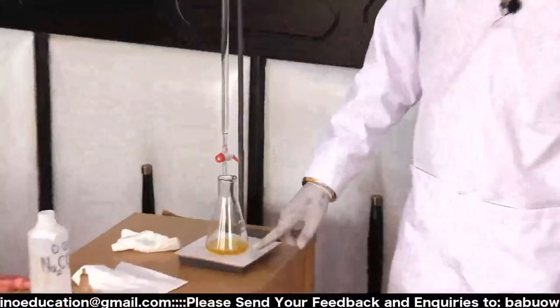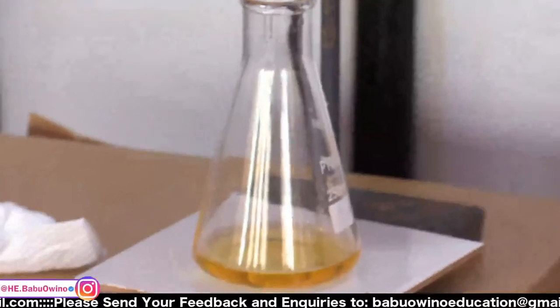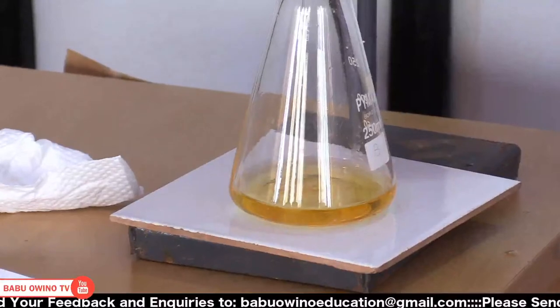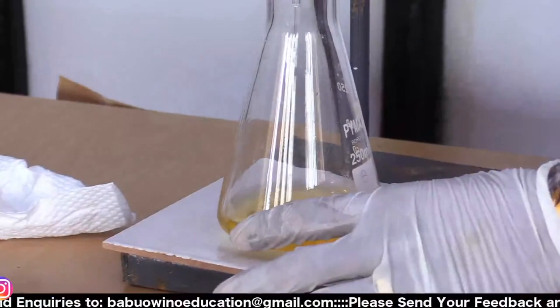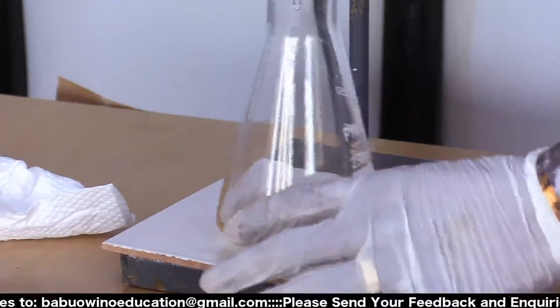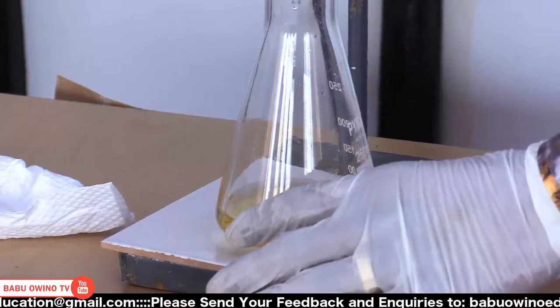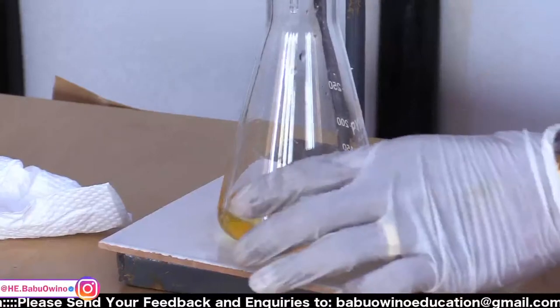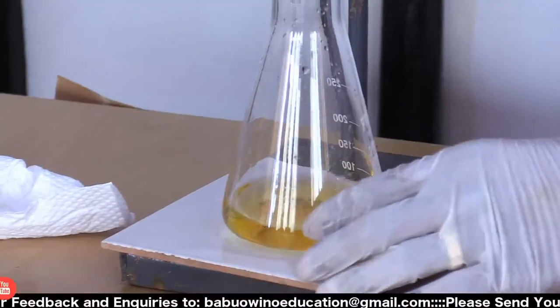From here, you notice that we have a different color. So let's run it and see. I want you to look at what's happening here. You run as you shake it. You release as you shake. You notice that there's a little color change. It's turning to a different color, which is pink. There's no color like pinkish, so it is pink.